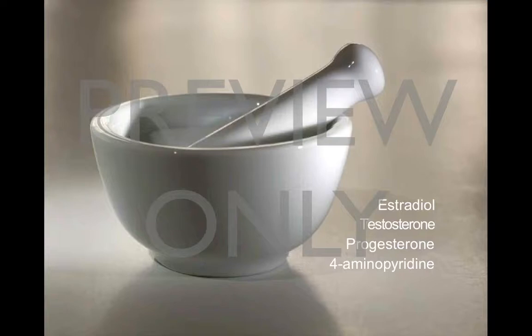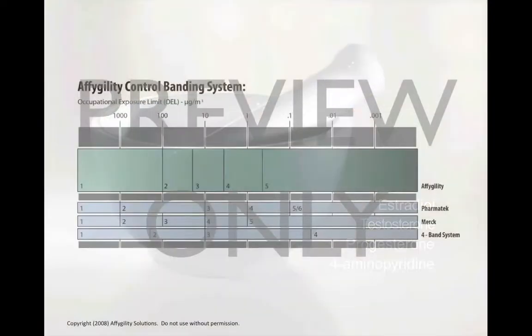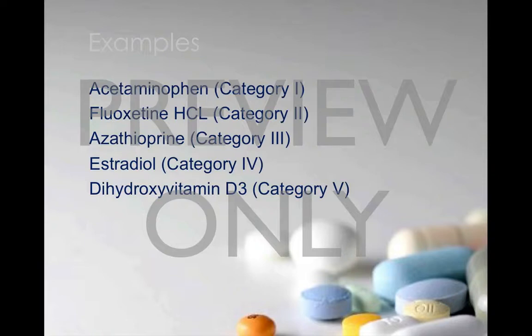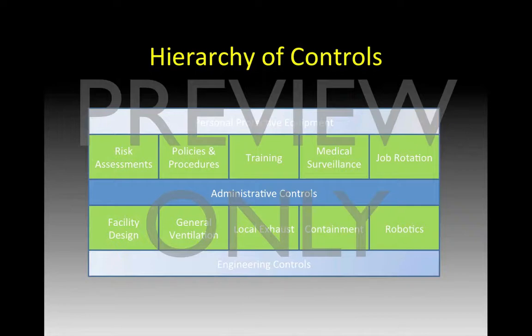We will demonstrate the importance of potent compound safety controls and practices, even at a small scale. We will discuss control banding and the differences in control banding systems, provide examples of compounds that have been placed into control band assignments, and discuss the hierarchy of controls necessary for preventing occupational exposures to potent compounds.